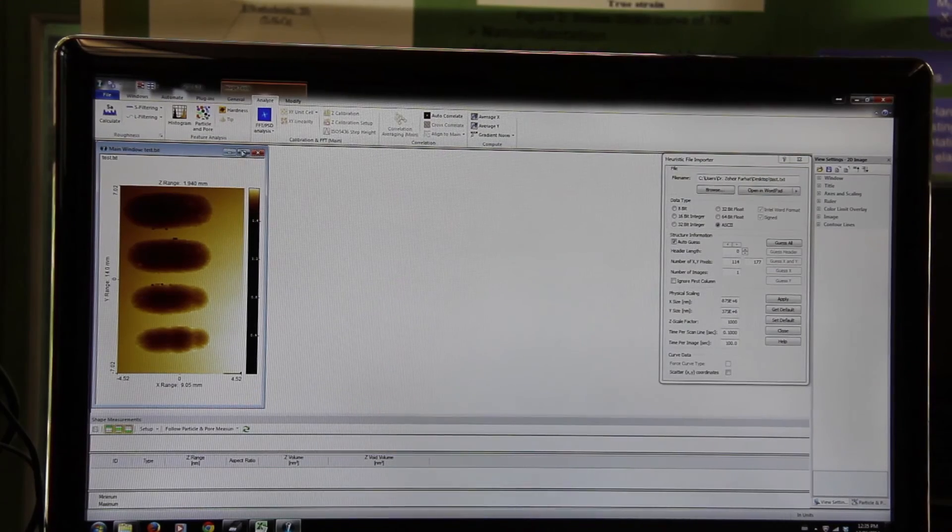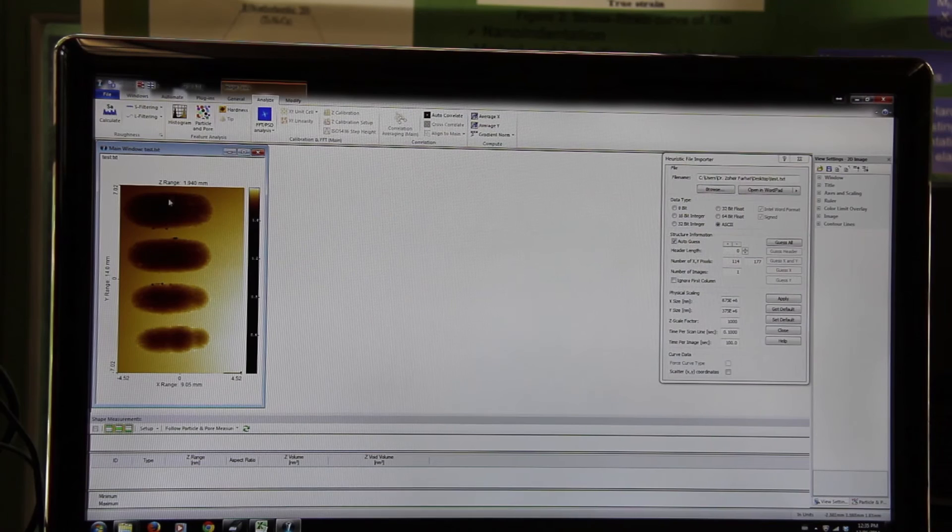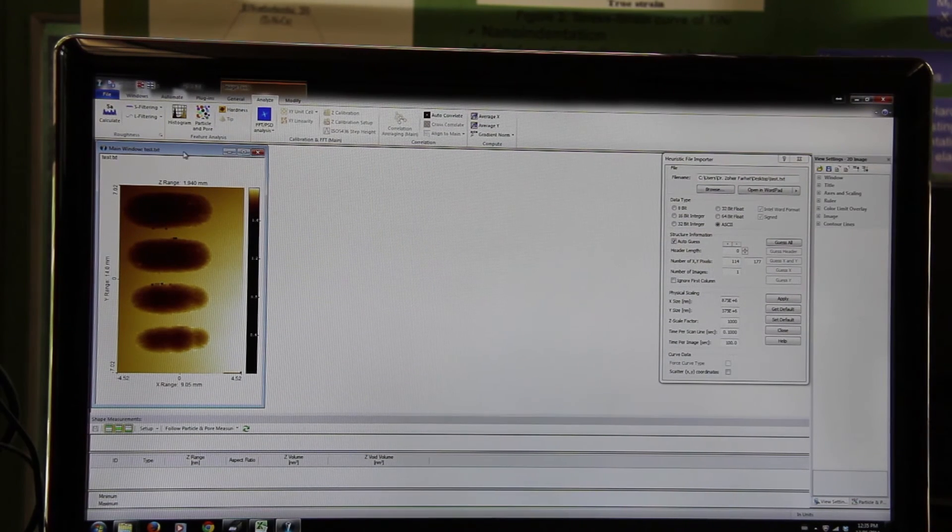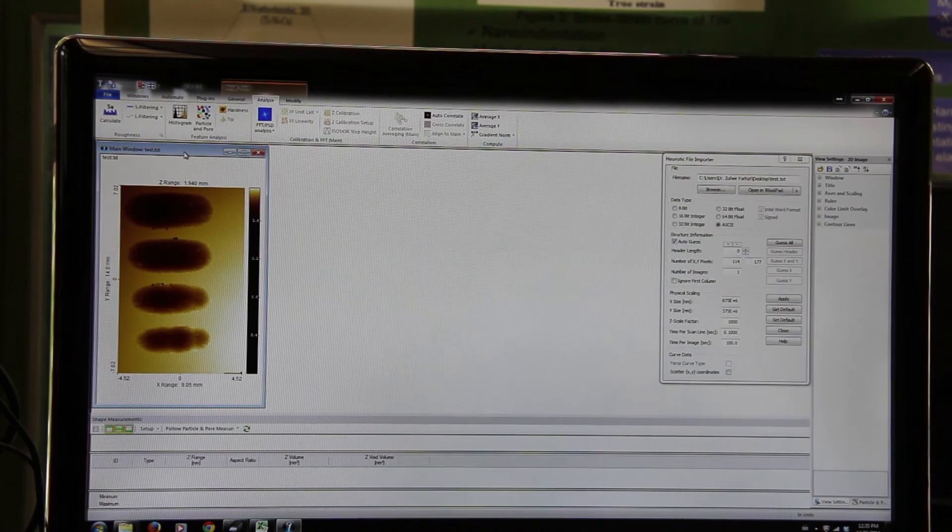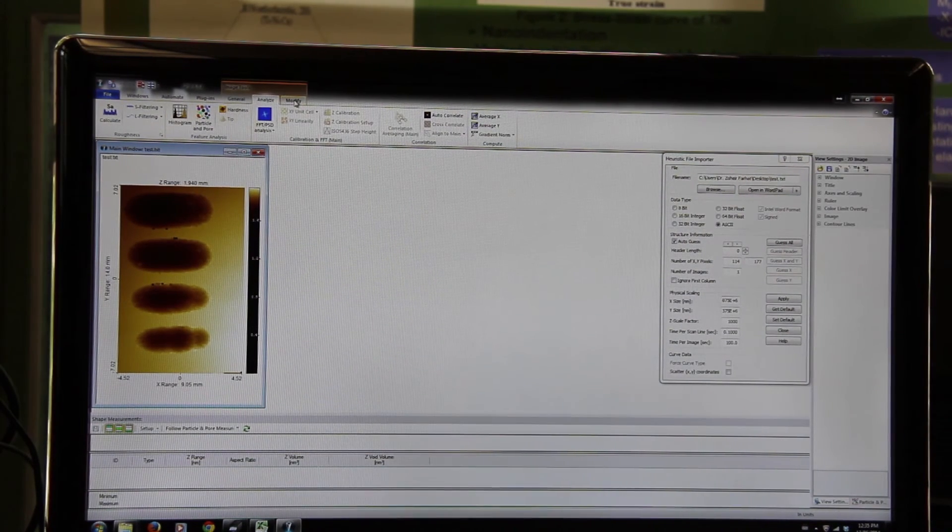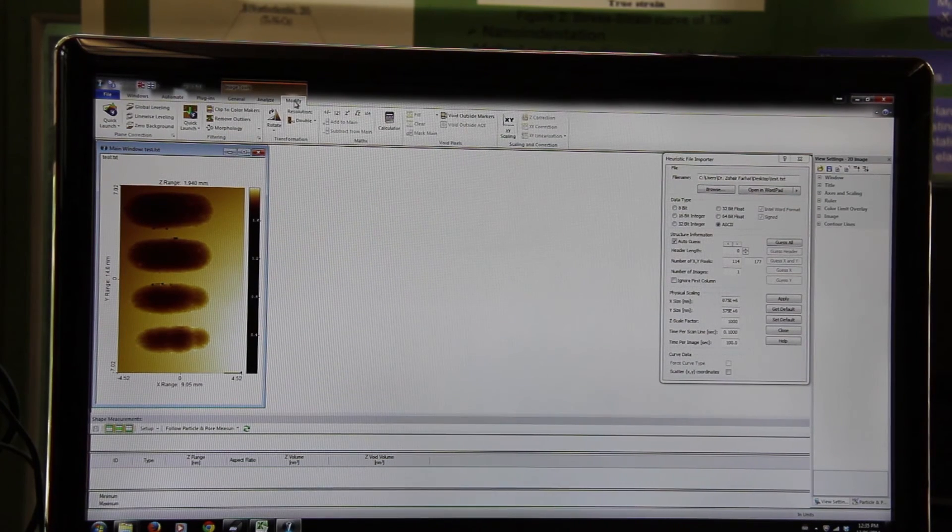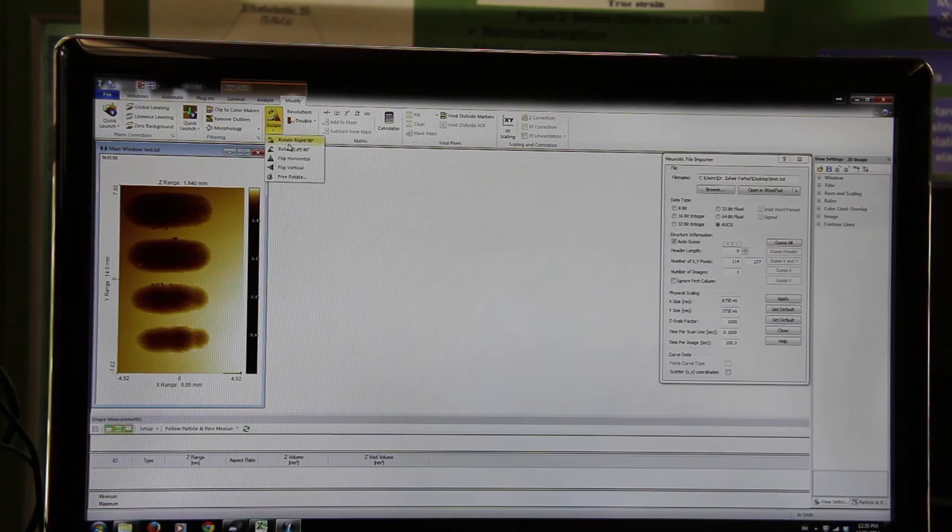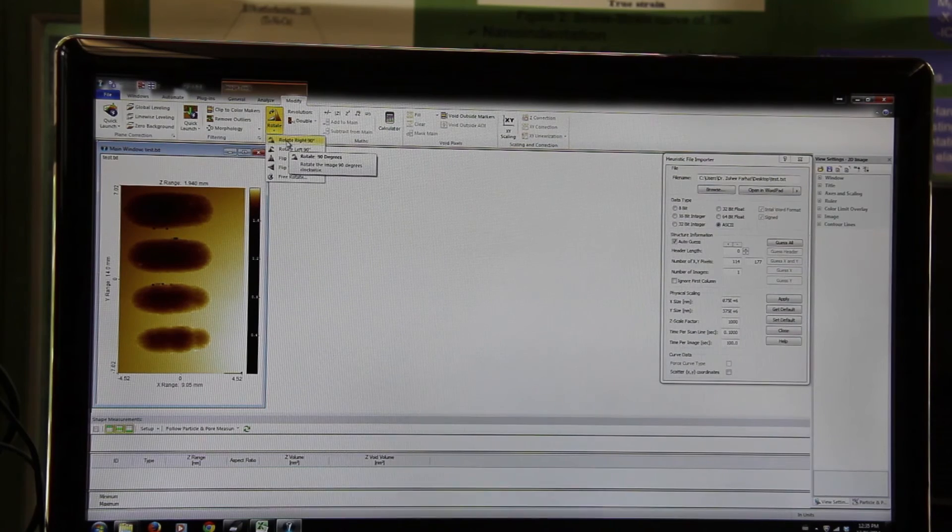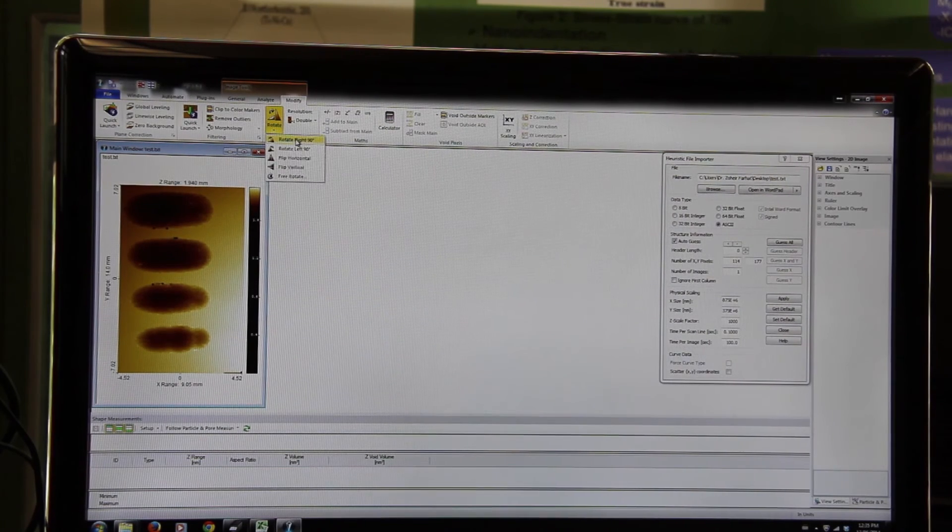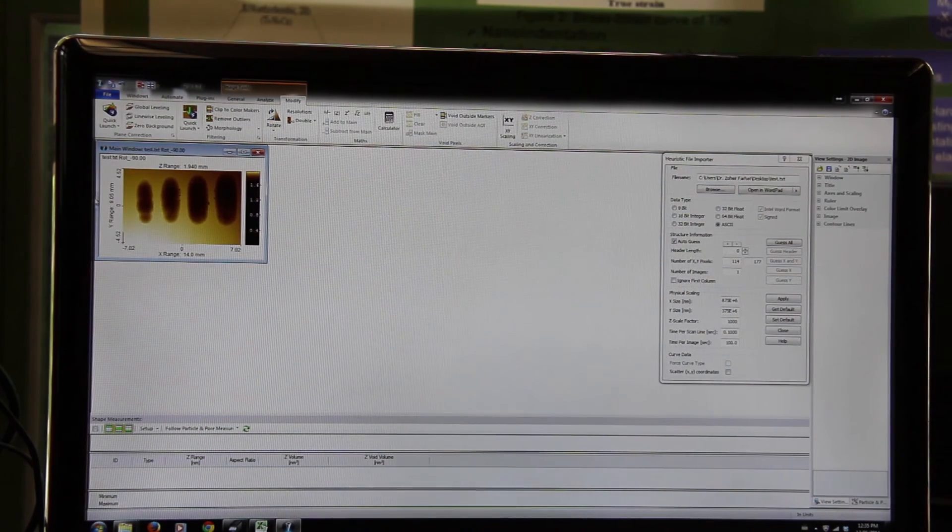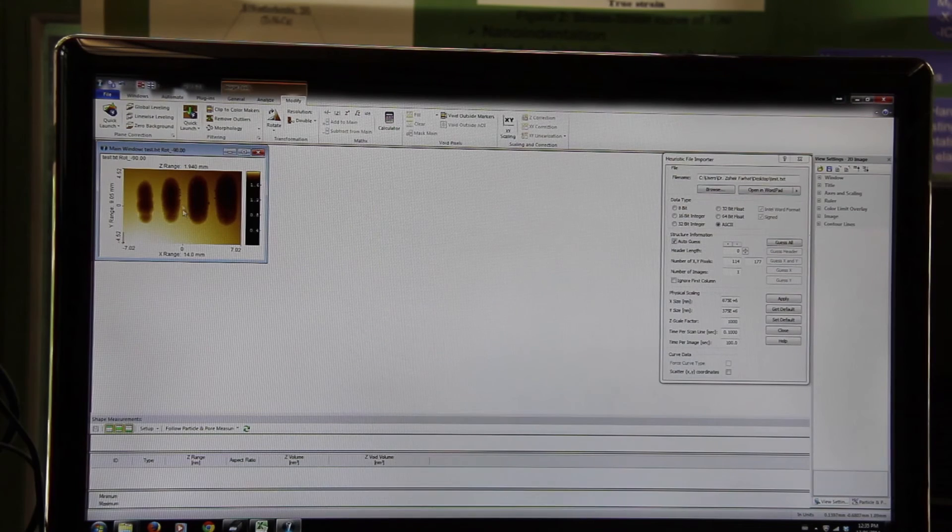This is a two-dimensional image of our scan. If you want to rotate it, you just need to go modify, hit rotate, rotate right 90 degrees. So this is the image of our scan.